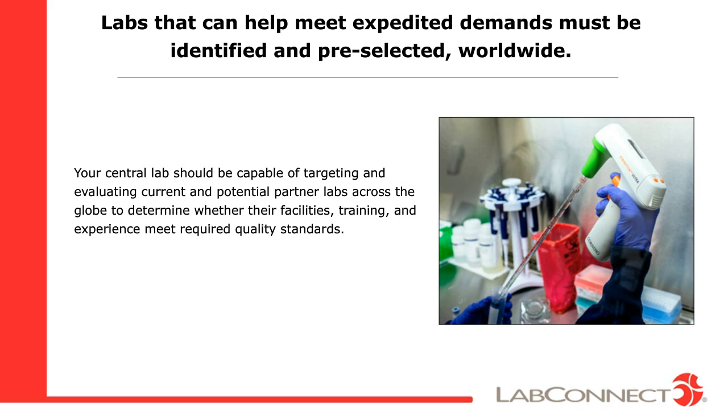In addition to quality and capacity considerations, technical considerations will likely also come into play. In the instance when a comparable method is required to be run globally, we would need to ask, does the processing lab have the ability to change methods and potentially qualify and perform additional qualification activities?